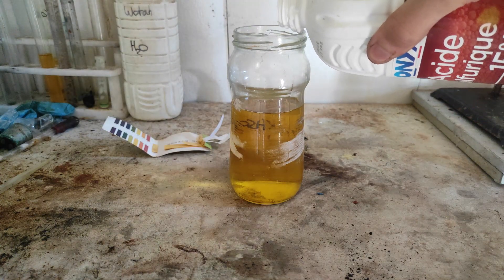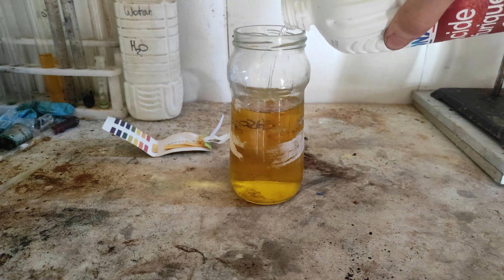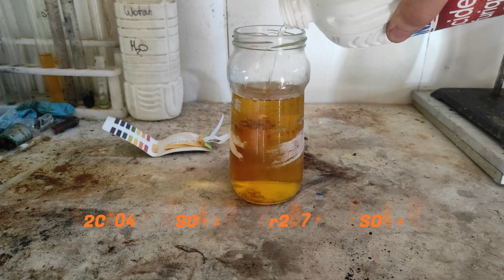If you only want sodium chromate, you can just boil down the solution to dryness. But here we are going to convert it into sodium dichromate by adding sulfuric acid. Chromates are yellow while dichromates are orange.